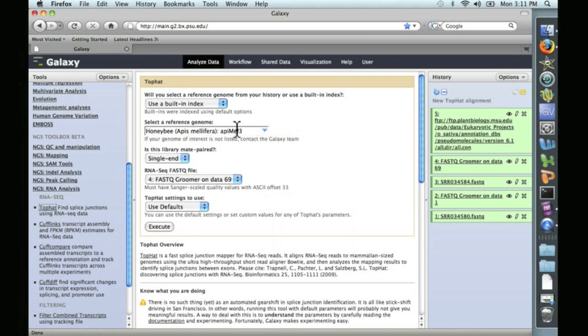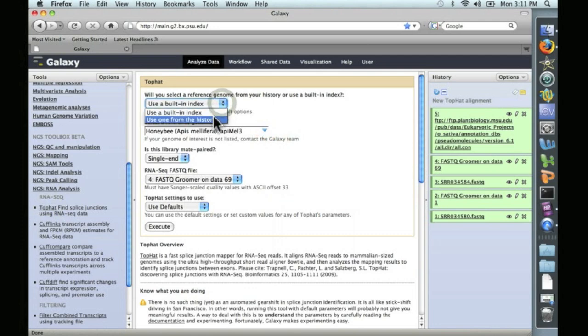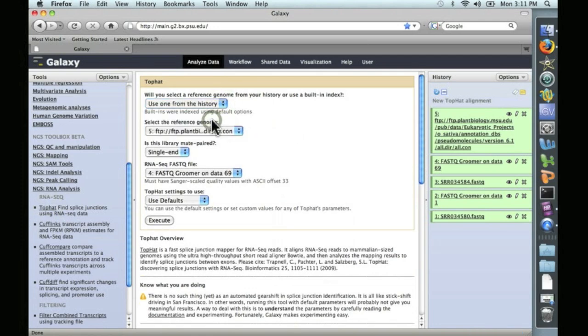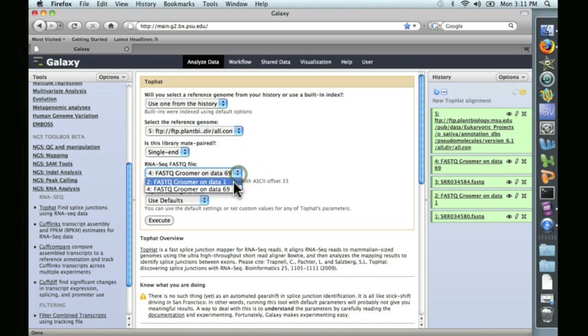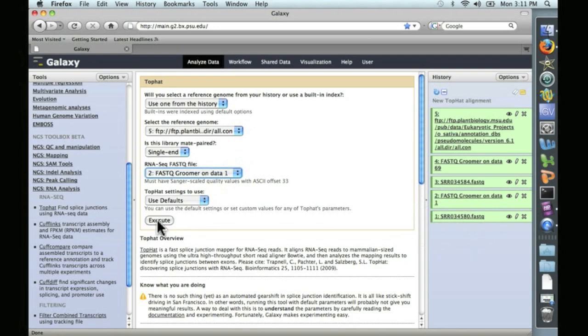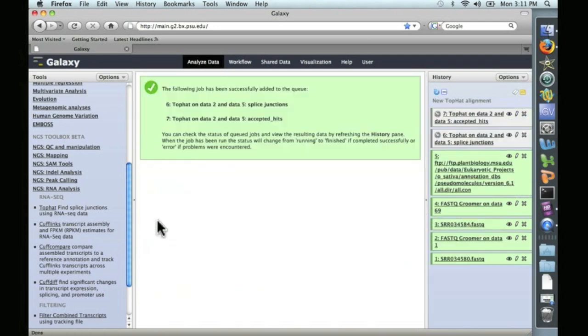As before, we don't want to use a built-in index. We want to use a reference genome for the alignment. So click on Use One from the History, and it automatically finds the reference genome. And let's go ahead and run this on the first dataset. So this one down here. Default settings are fine. Go ahead and click Execute.